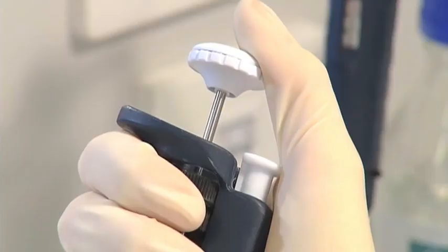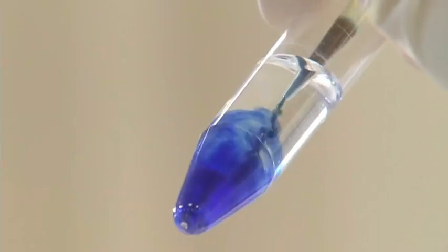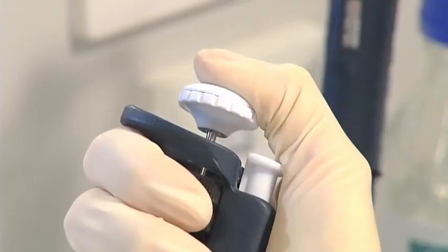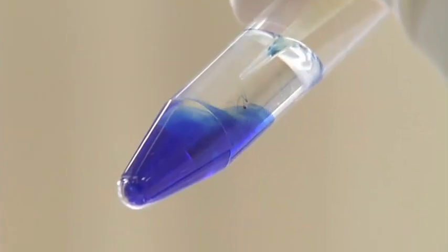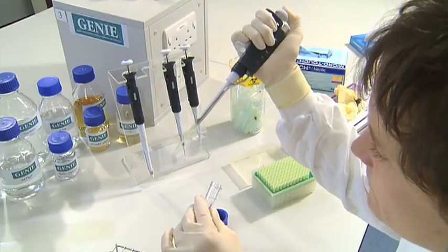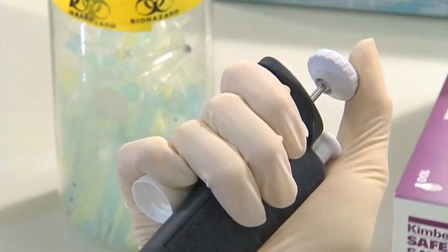Slowly push down on the push button. This will release the liquid in the pipette tip into the tube. This time, push beyond the first stop. This ensures that any residual liquid is expelled from the pipette tip. Fully withdraw the pipette tip from the liquid before you release the push button.